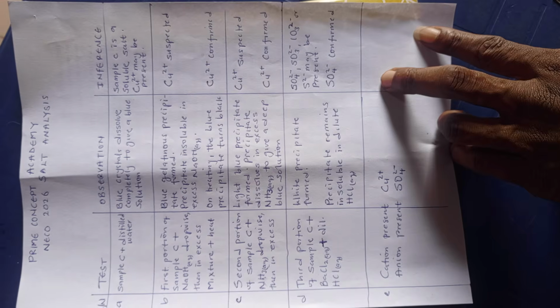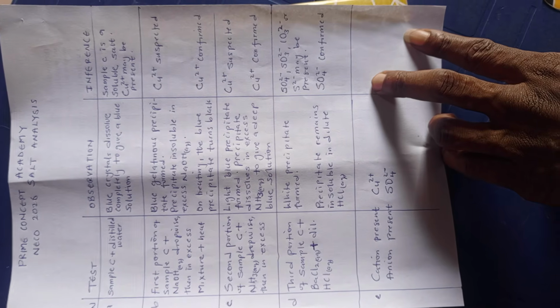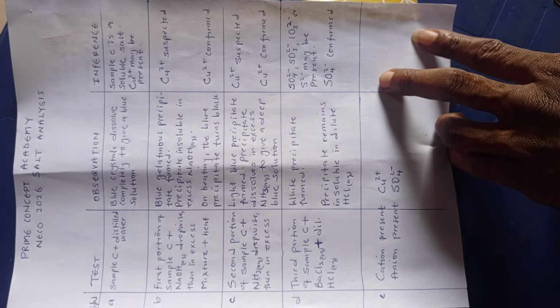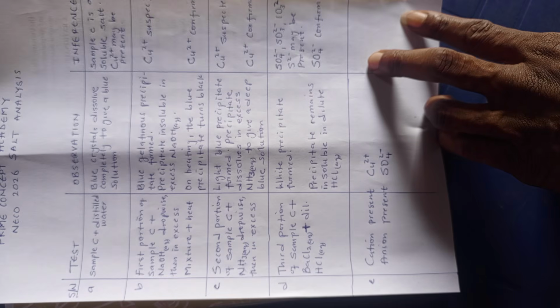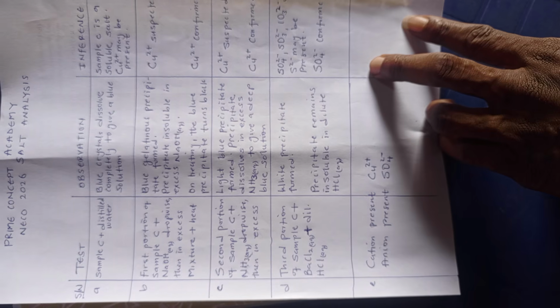You see the observation, blue crystal dissolves completely to give a blue solution. What is the inference? Sample C is a soluble salt. Copper may likely be present. So the B part of it, first portion of sample C plus sodium hydroxide dropwise, then in excess. So you'd see the observation and so on. So this is what you're going to follow.